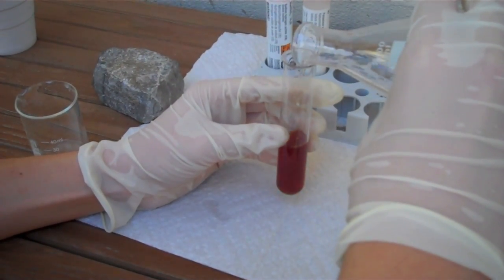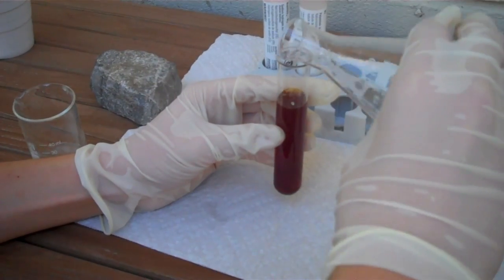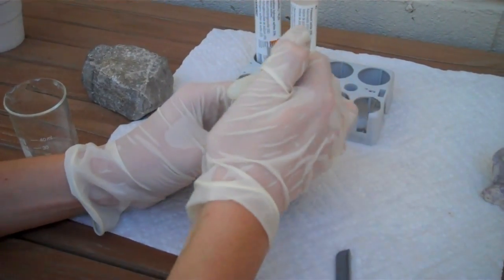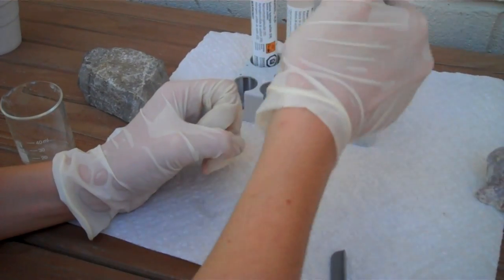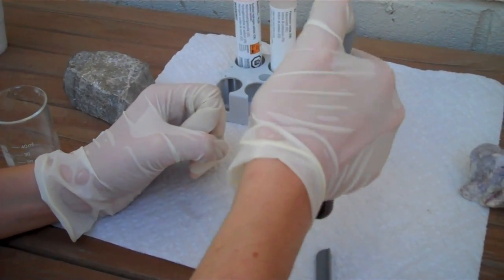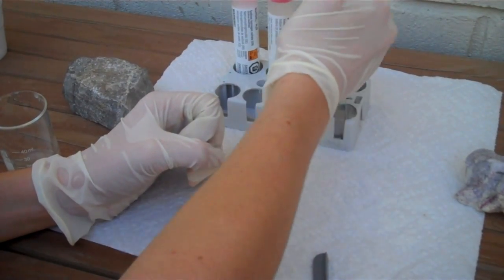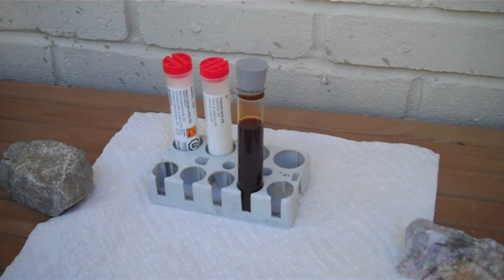The solution will immediately turn brownish black. This is because solid iodine is forming, and because iodine is not very soluble in water, it will collect at the bottom of the test tube. I'm just mixing the solutions. Now I'm going to let that sit.